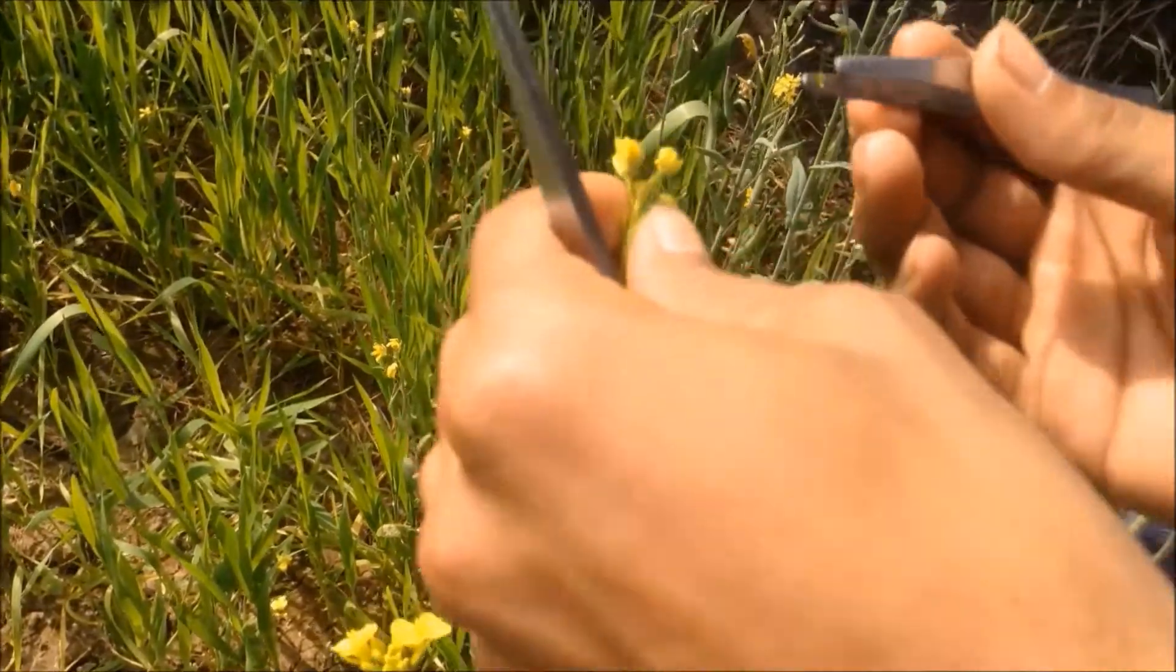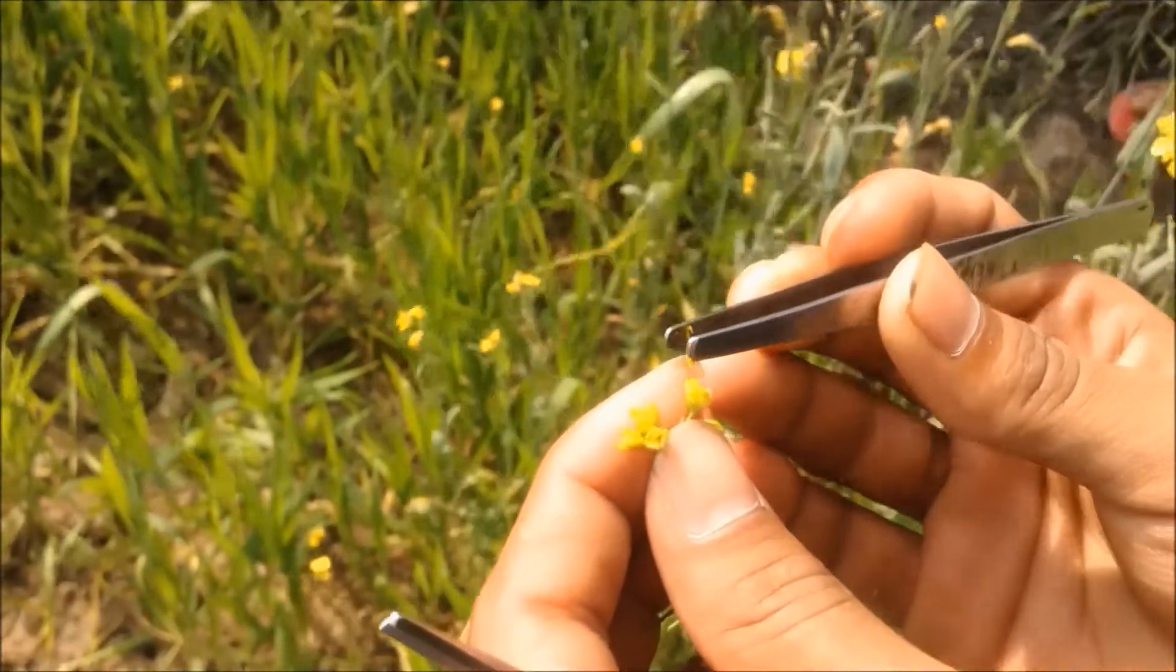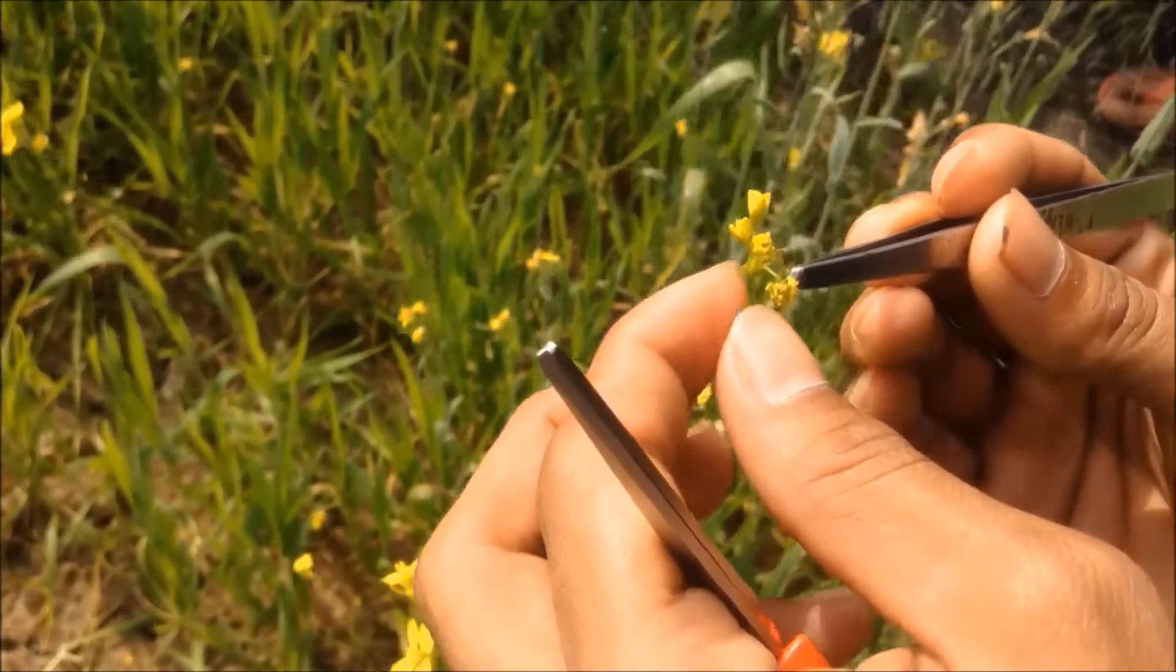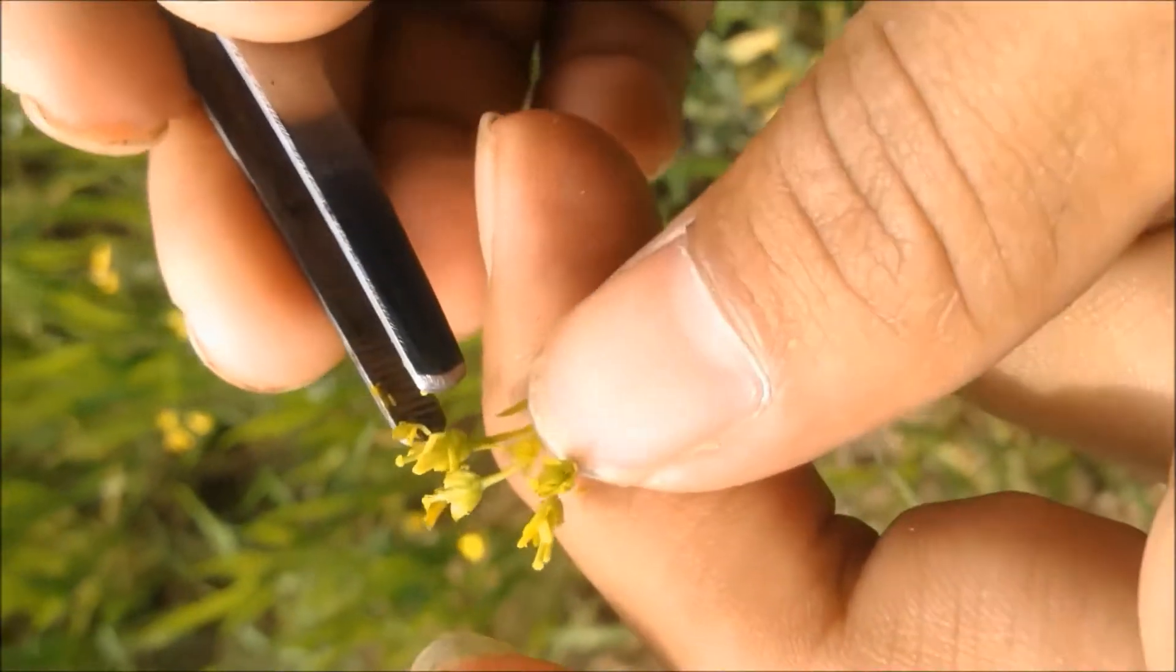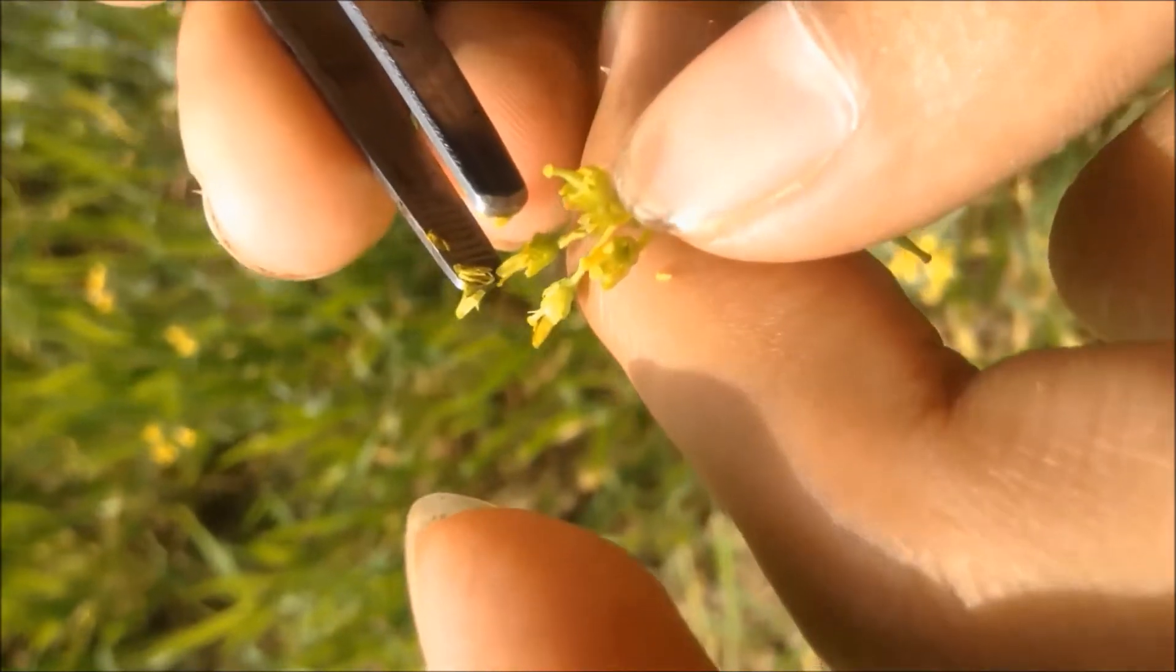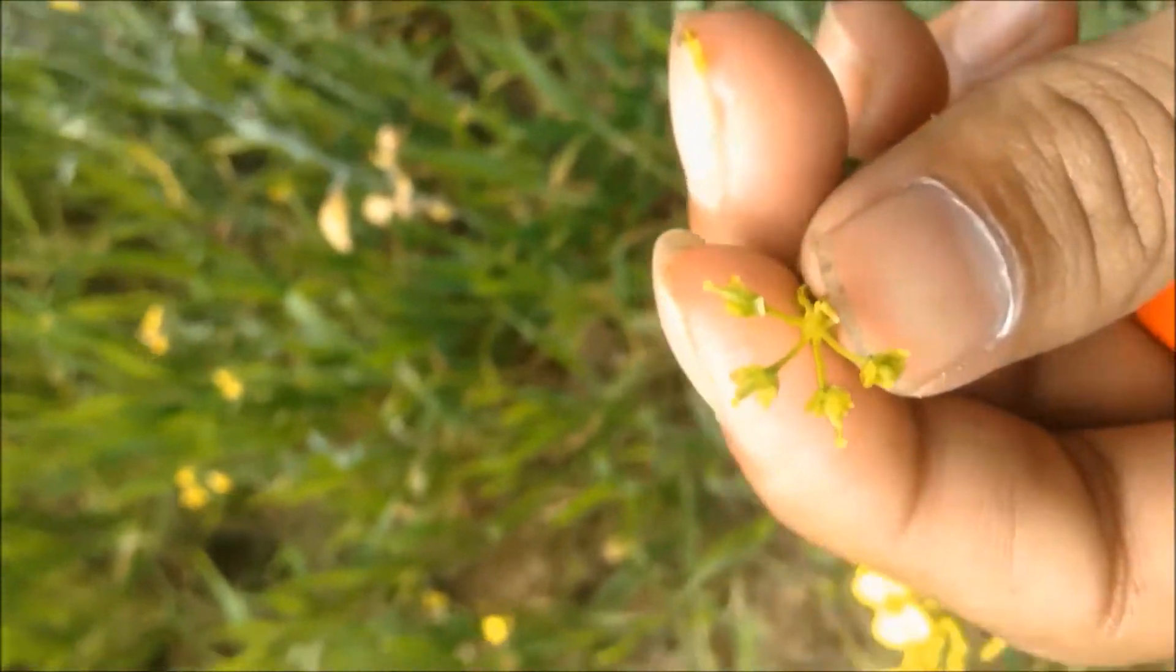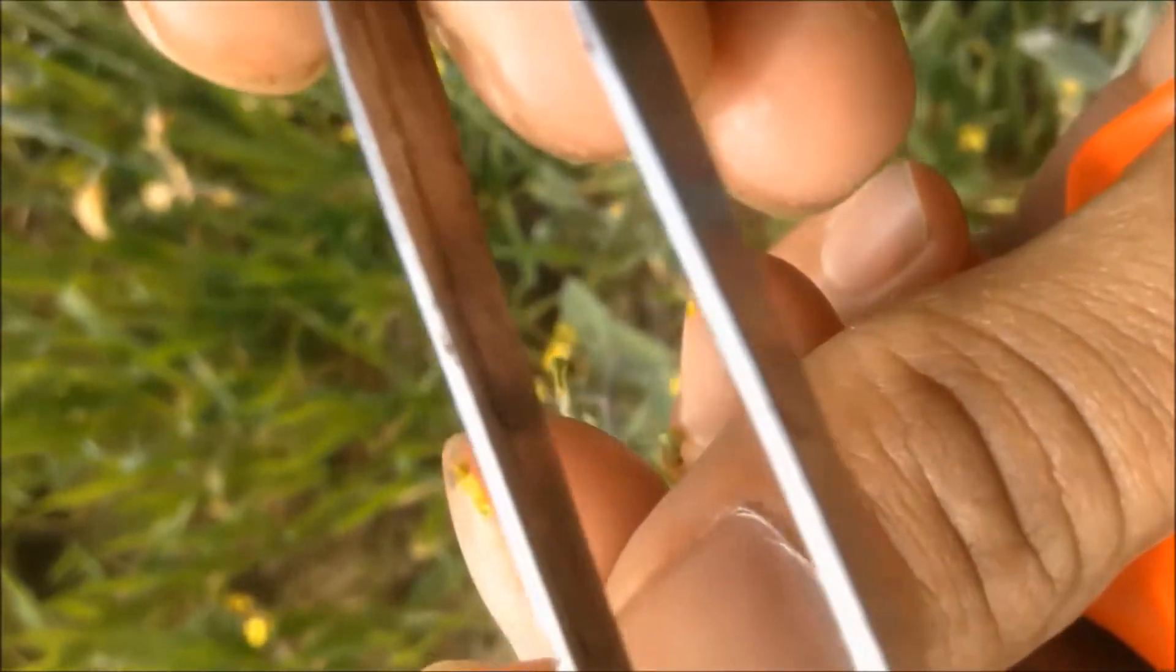Next I remove all the petals and stamens without injuring the stigma with the help of forceps. We have to be very much careful during this time. You can also see in the screen. Now we have five buds ready for the pollination.